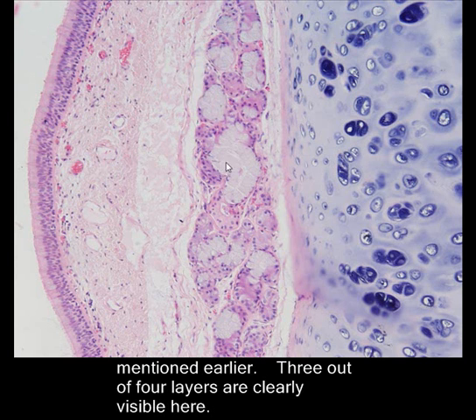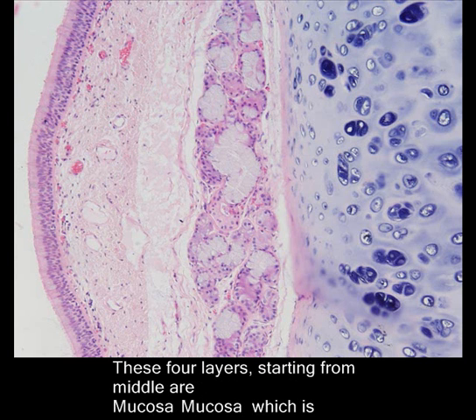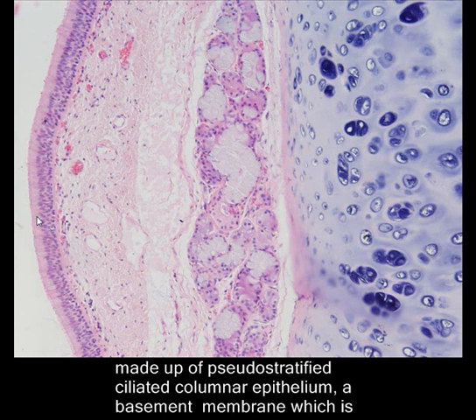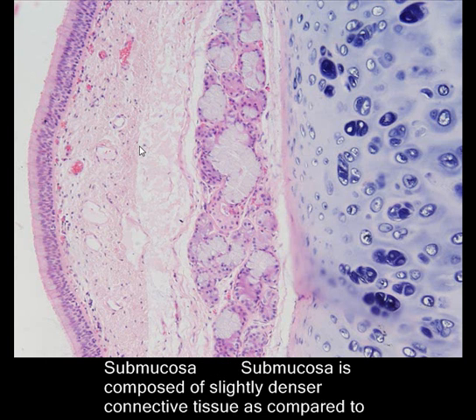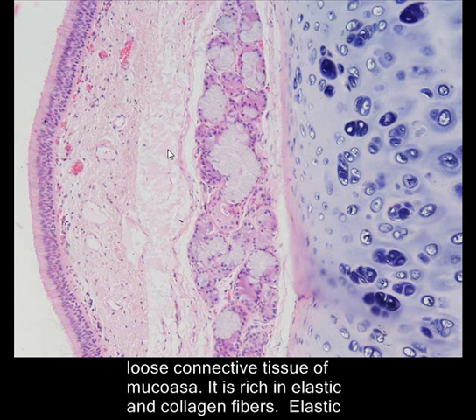These four layers starting from the middle — this is the inside of trachea — are mucosa, which is made up of pseudostratified columnar epithelium, a basement membrane just below the epithelium, and a layer of loose connective tissue. The basement membrane is made up of fibers, and the submucosa, which extends from here to here, is composed of slightly denser connective tissue as compared to the loose connective tissue of mucosa.